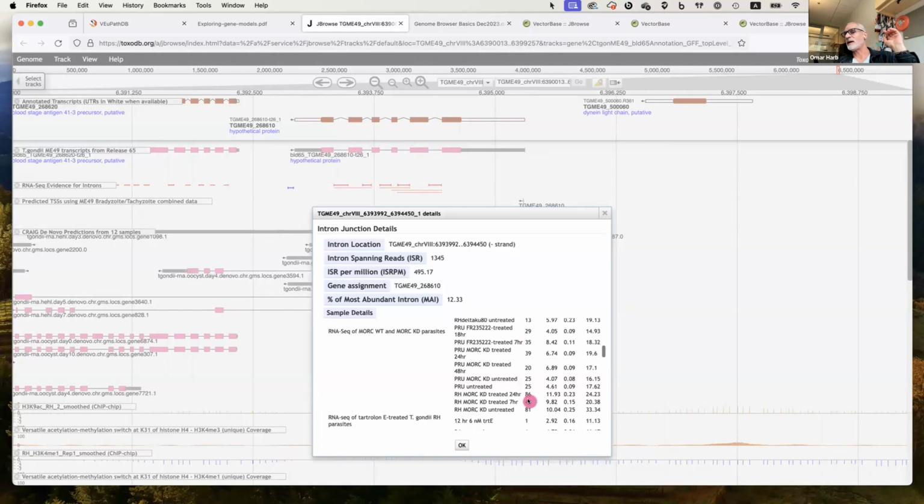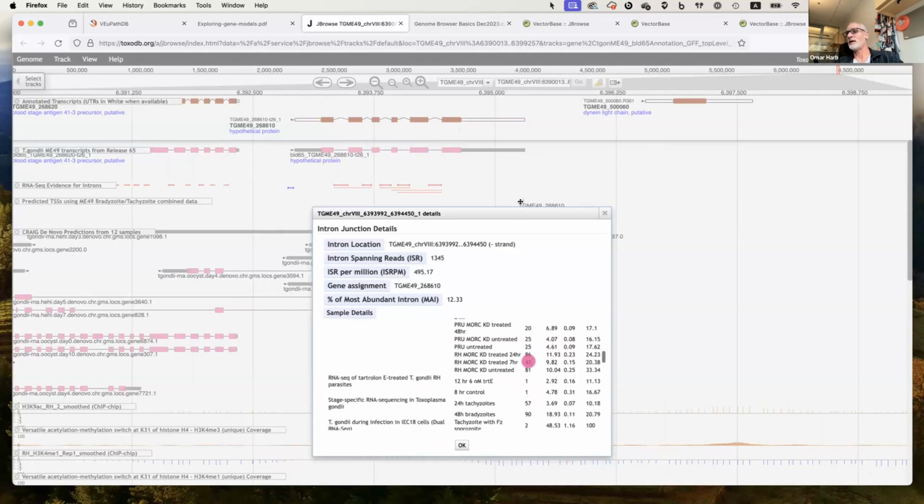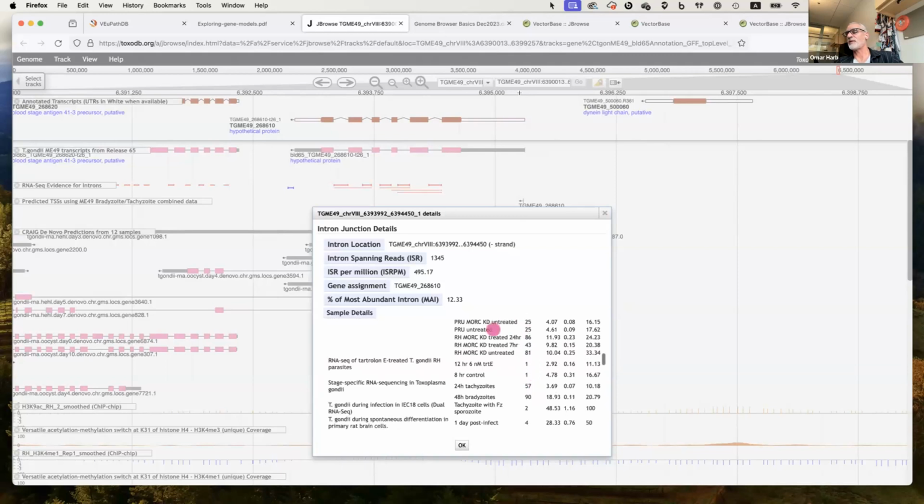Okay. So then these transcription start sites. Again, it's based on real data, but there's also some level of confidence that was assigned to these, and these are the most confident ones from their experiment. So they're pretty good, but they're not always 100% good. In this case, you can take a look at it. This transcription start site looks like it starts with this. Maybe that was the evidence that was used.